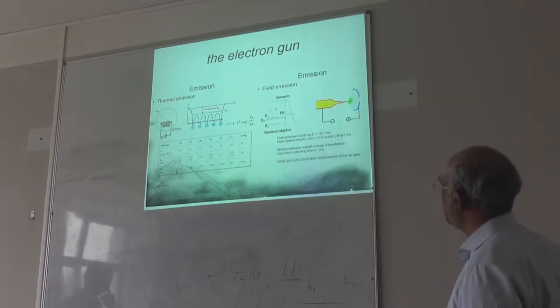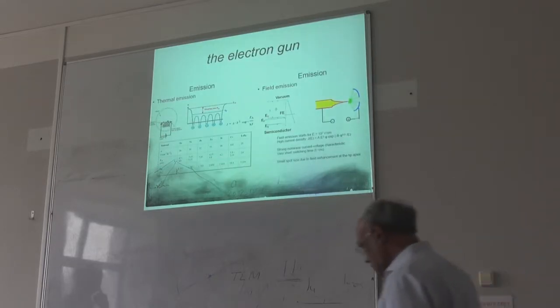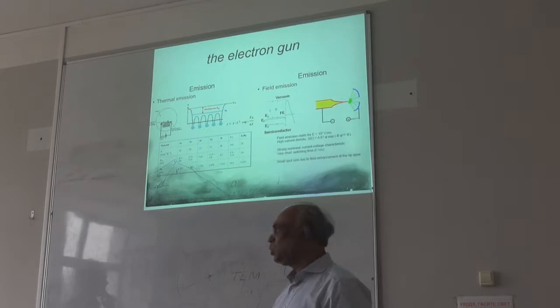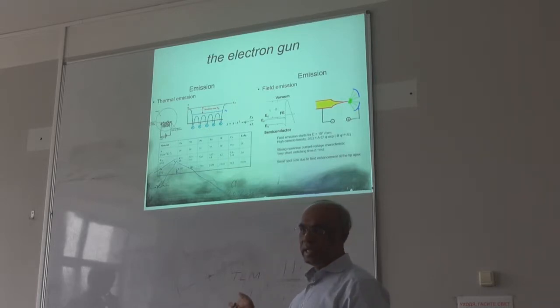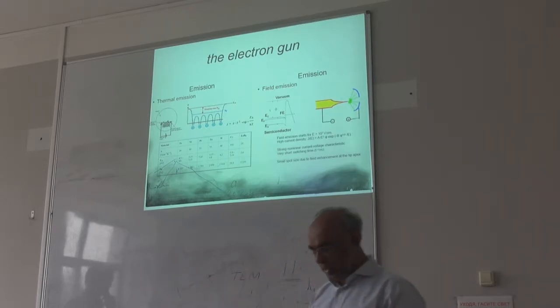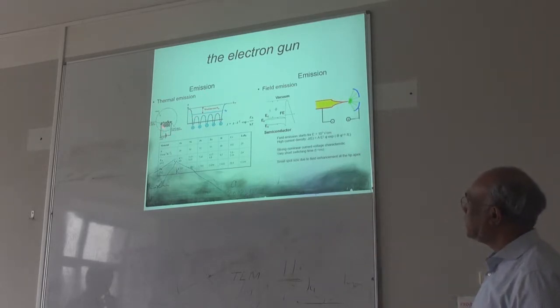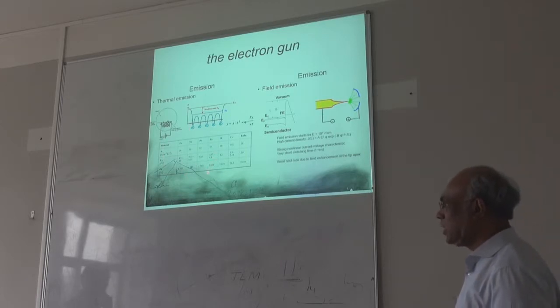First, when you talk about these microscopes, these are all electrons, right? First you need to generate electrons. How do you generate electrons? There are two techniques they use. One is called thermionic emission. You just heat a filament, then you can emit electrons, right? That's called thermionic emission.